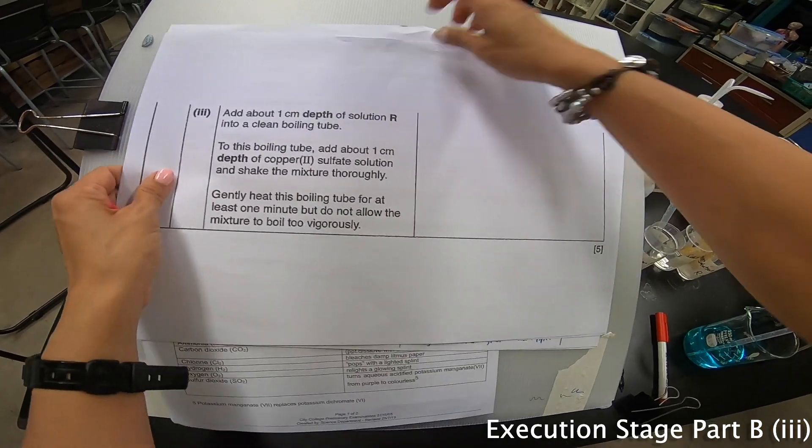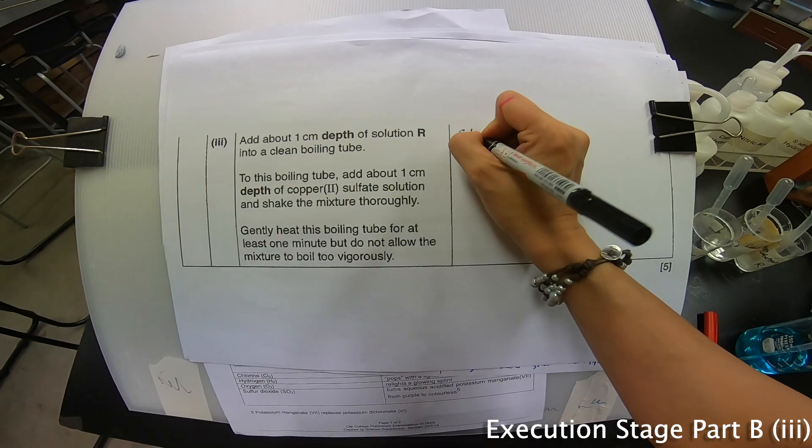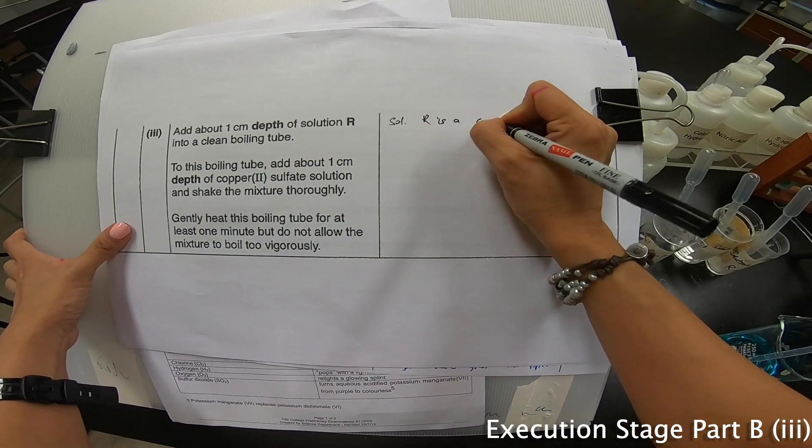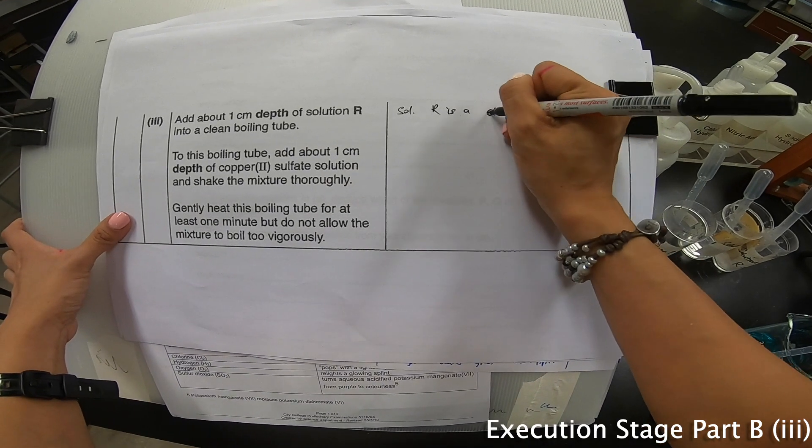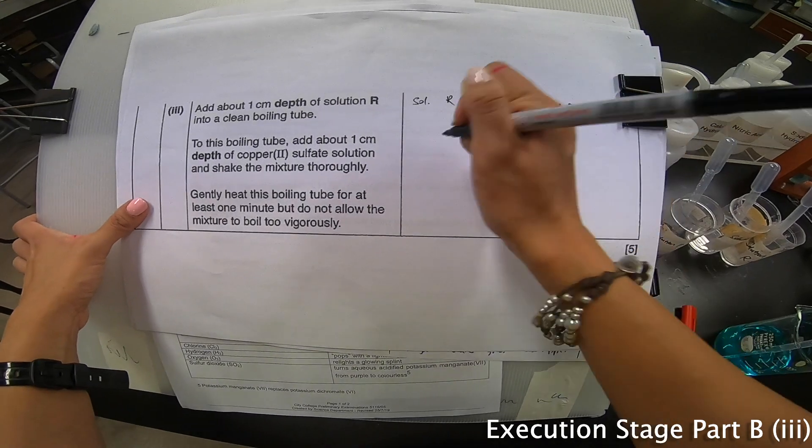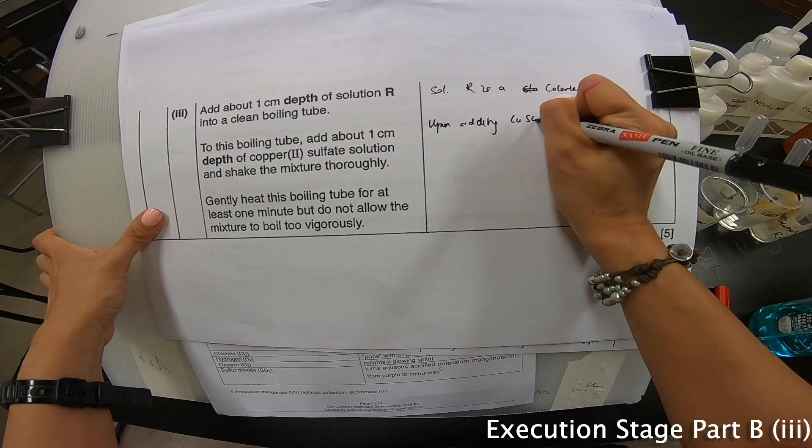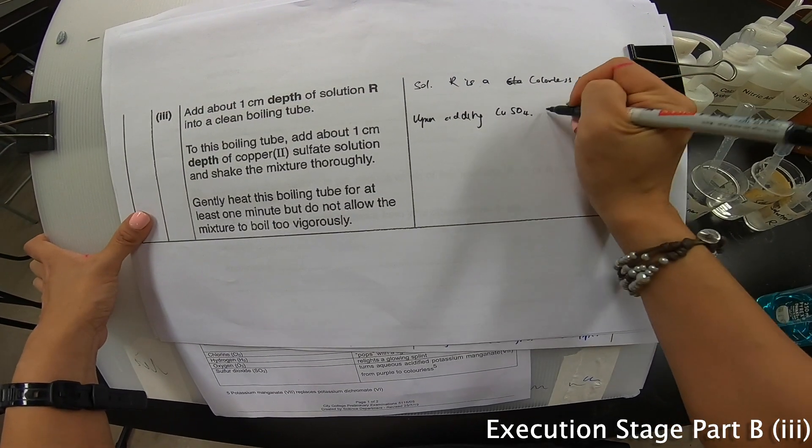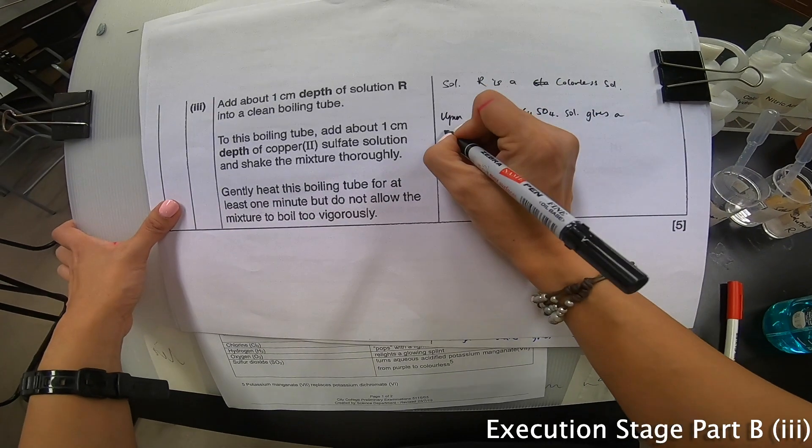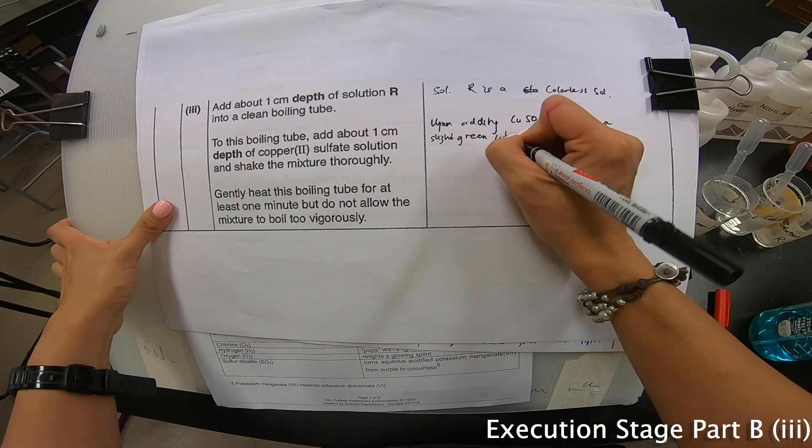And let me add a little bit of the copper sulfate. Now R is a clear solution. Upon adding my copper sulfate solution, it is still clear but the color changes a little bit. So I'm going to write it down over here first. But before I do anything, let's take a look at the boiling process. So it's boiling, it's boiling, and it's changing a little bit of color.